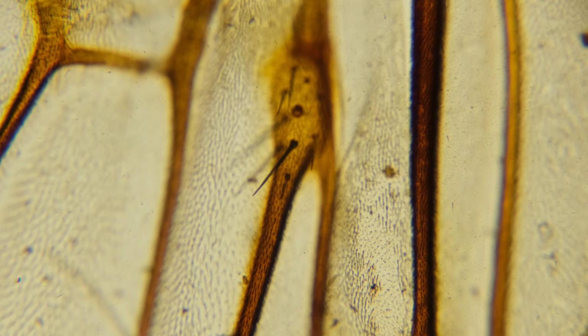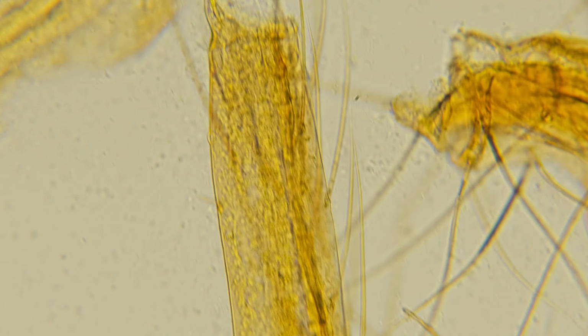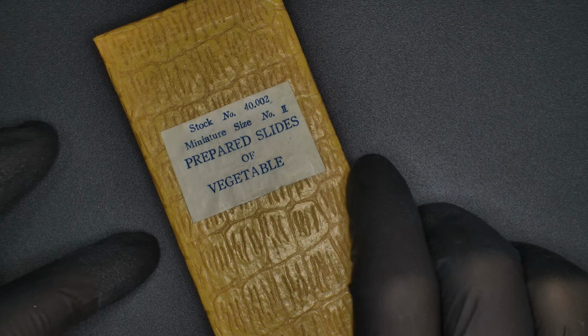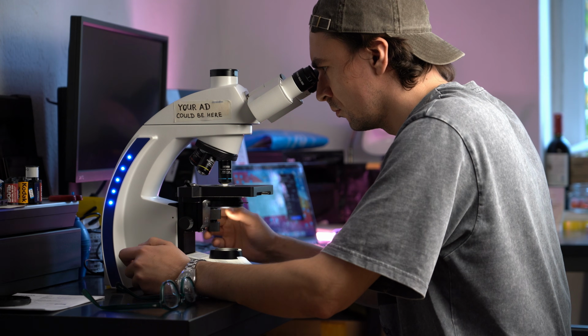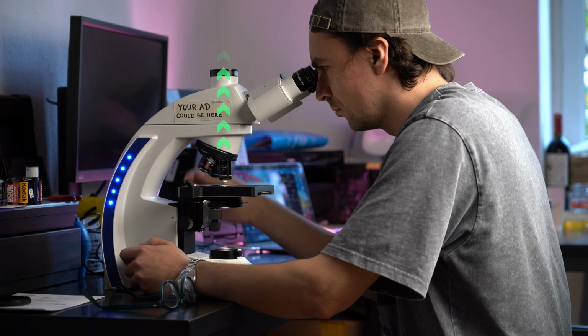If your object isn't flat, observing it becomes very difficult. Magnification is high, depth of field is just microns. River sand, insects or fibers will be extremely hard to visualize. Compound transmitted light microscope is a perfect solution for blood smears, prepared slide collections and permanent samples under a cover slip. One key thing to pay attention to: try to find a microscope with infinity corrected objectives and RMS threads.